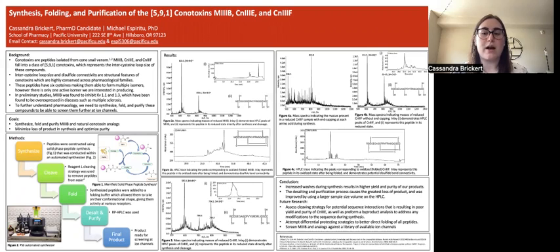The appropriate amino acid is then added to our resin. We then have the coupling step, where the amino acid reacts to form a peptide bond, which is starting the formation of our peptide. After the coupling step, there are several what we call washes, where a solvent is used to wash the resin and peptide to remove any unreacted reagent and amino acids. This can interfere and form impurities within the peptide.